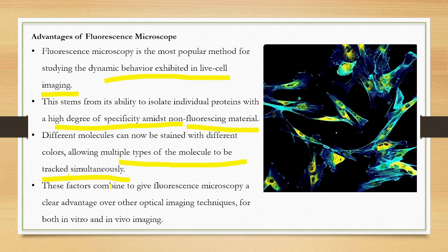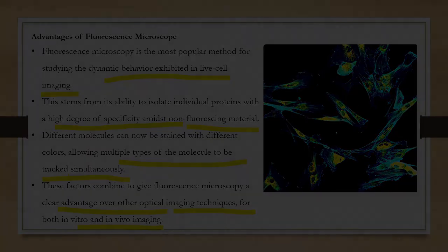And the last one, these factors combine to give fluorescent microscopy a clear advantage over other optical imaging techniques for both in vitro and in vivo imaging. That's all about the fluorescent microscope.